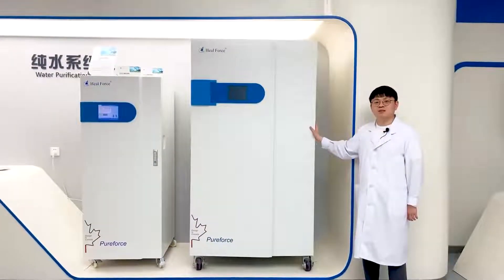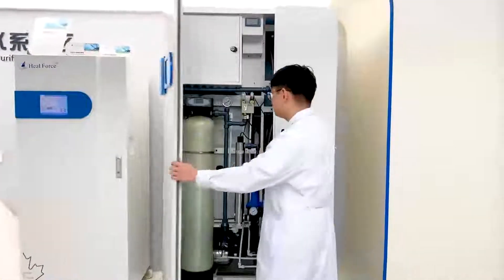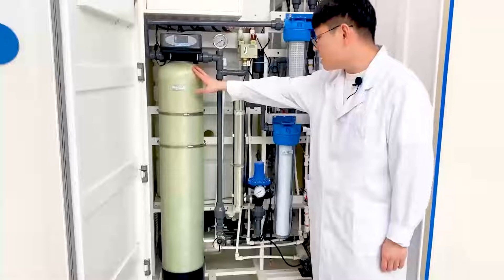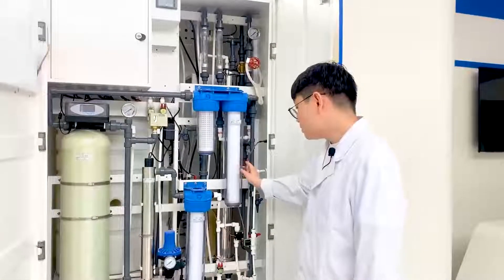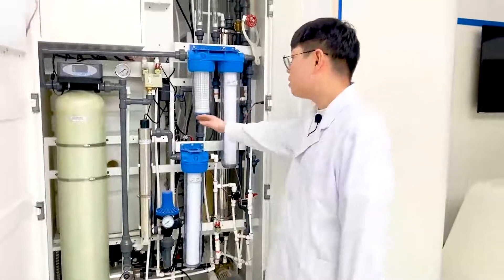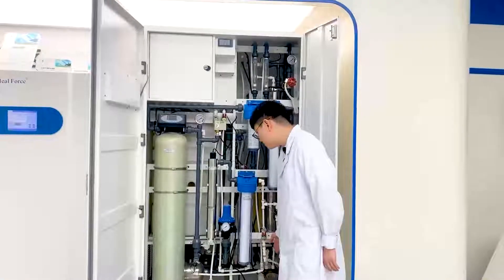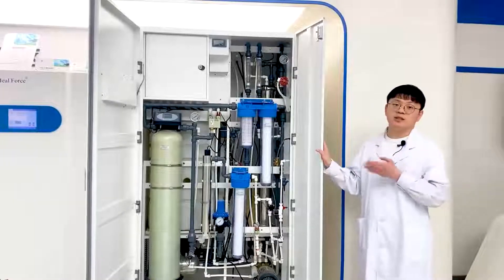This is the bigger Pure Force series. All parts are bigger — larger pre-treatment cartridge, larger final filter, larger UV light, larger RO module, and a 350-liter water tank with a bigger pump. If your water demand is very high, you will need this type.